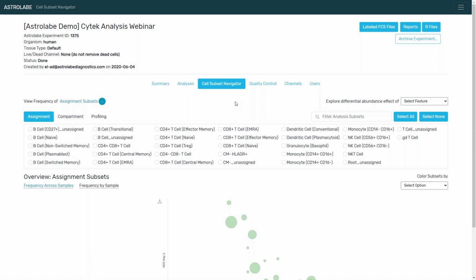We published it in June of last year, so it's publicly available. It's peer-reviewed. It's open source. And the way Ekbalam works is by clustering the data and then labeling it based on these rules. I will briefly mention that we've done several validation studies of this algorithm, including with Cytek themselves. And we see very high overlap between the labeling algorithm and manual gating.